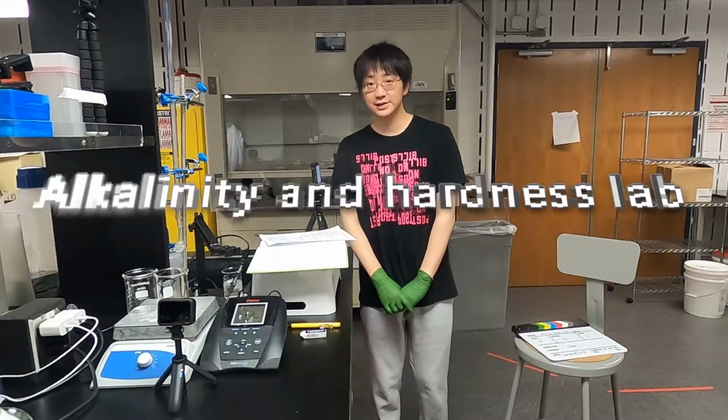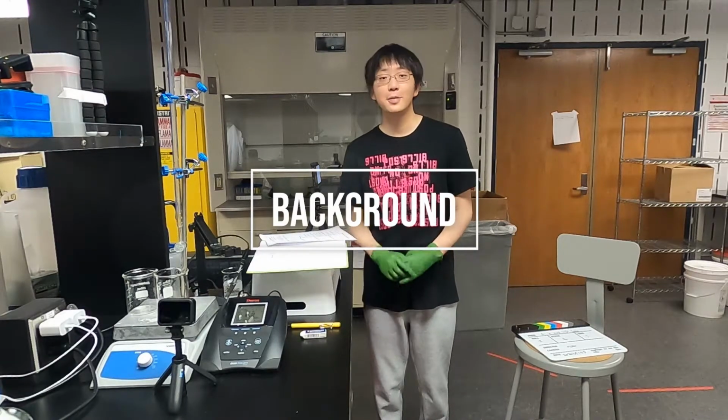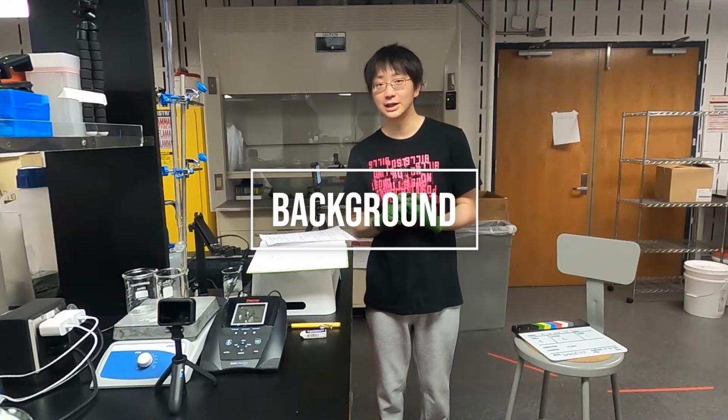Hello everyone, this is River and today we are going to measure alkalinity and hardness. But before we get started, I would like to go through some of the background.